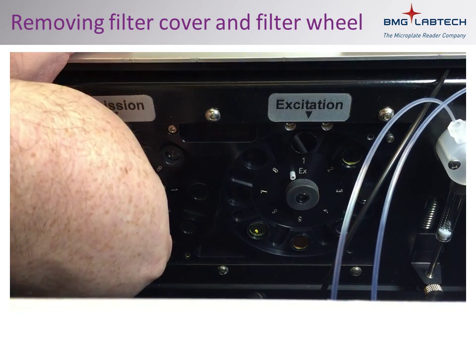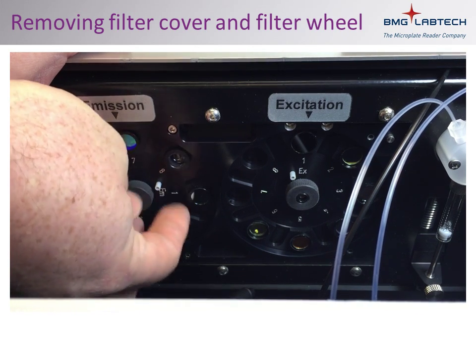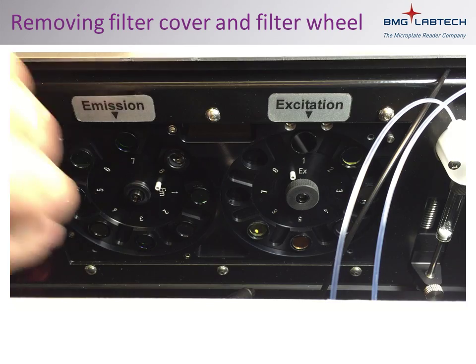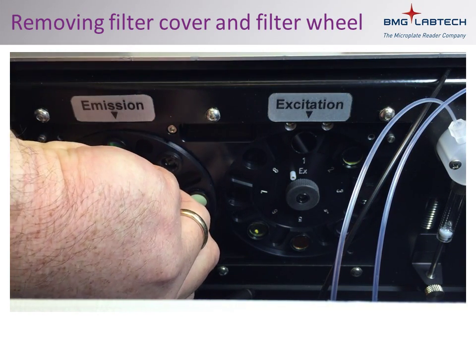Taking care not to touch the filters, hold the filter wheel in place while loosening the retaining nut. The filter wheel can now be lifted out.